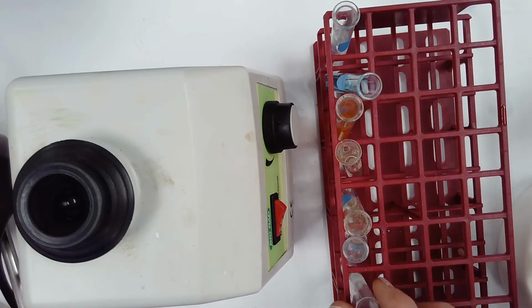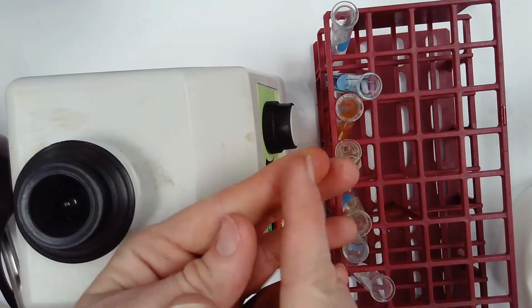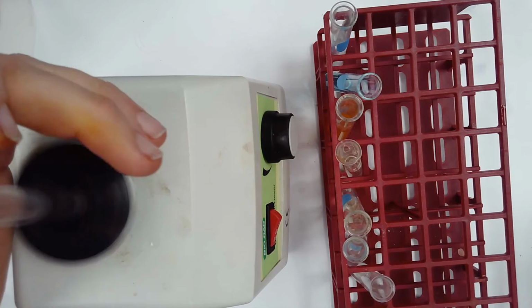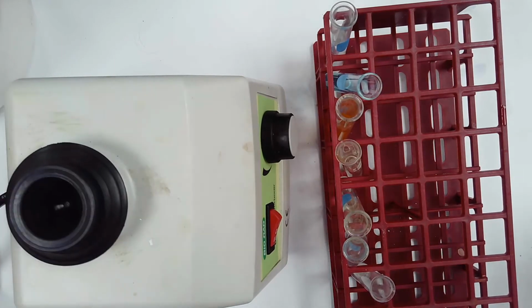One here also should probably point out that you might have noticed my fingers turning a little yellow as we're going along. That's the iodide from the KI. Whatever. Okay, I think we got one or two left. Just one left. We're going to do the ammonium chloride real fast. All right, and I guess we should also pour in a little bit of silver nitrate really fast.